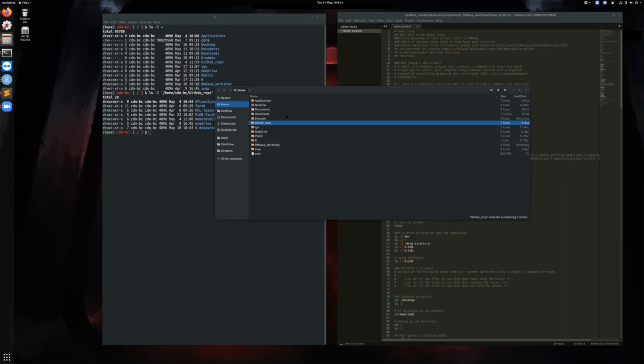So you want to see something like copy path, file or path name, because path tells you the entire directory or the entire address of the particular file or folder. If you just copy the file, it will not give you the entire path. That's the only small caveat. On the Mac, I think you can press Option and right click as well, and you have the option to copy path using the right click method. But if not, you can drag and drop, and that works perfectly fine on the Mac.